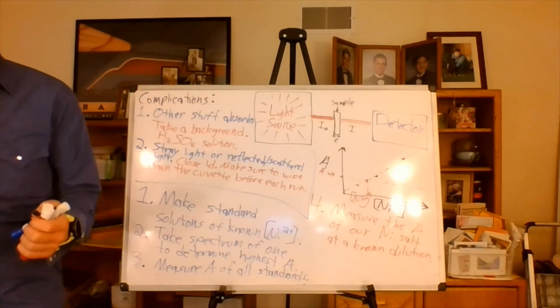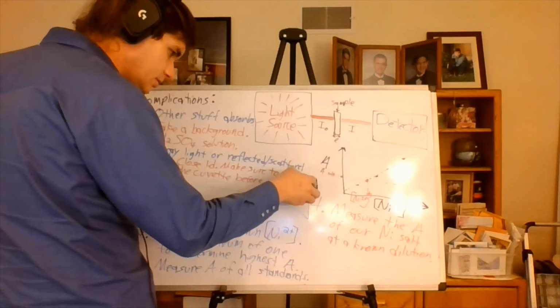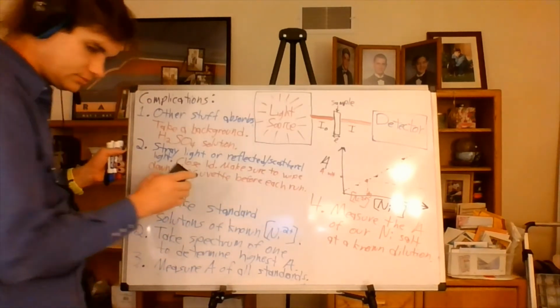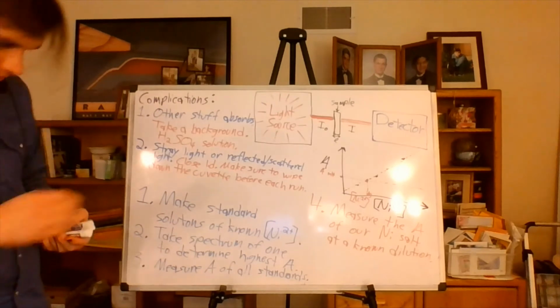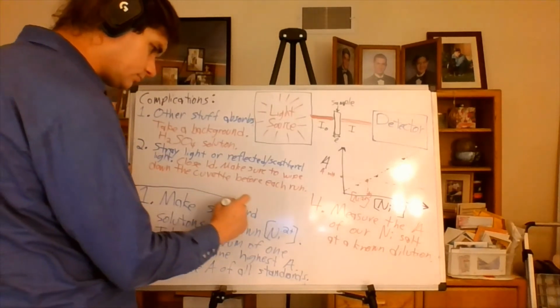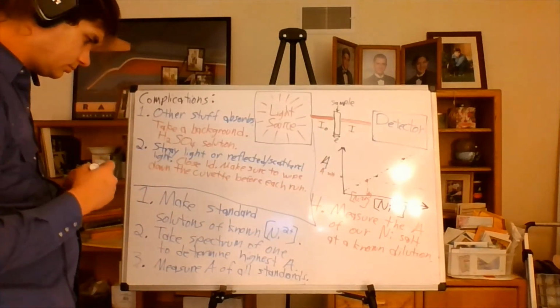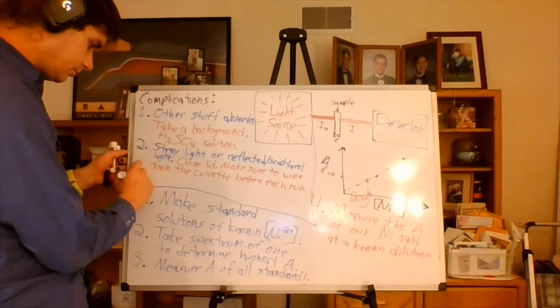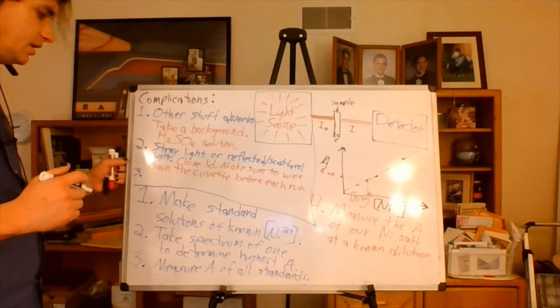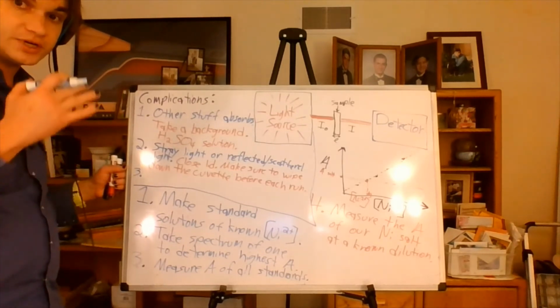So there is, now that I think about it, one additional consideration. Let's just erase this here. Draw the line a little bit down here, a little further. Three. And that last consideration is that we need the concentrations to be concentrations that we know.